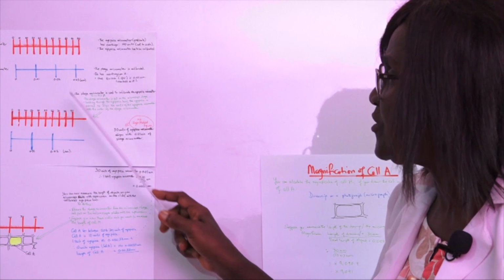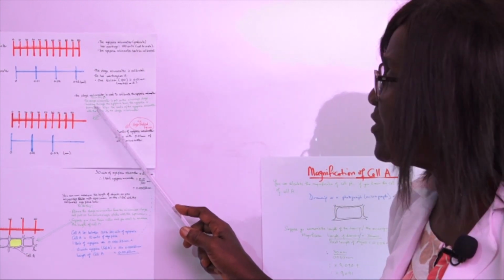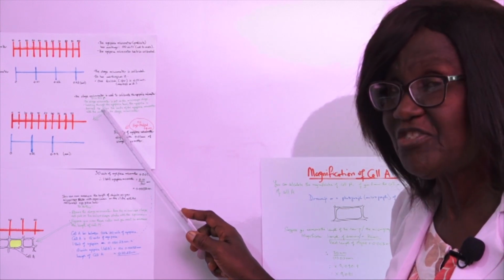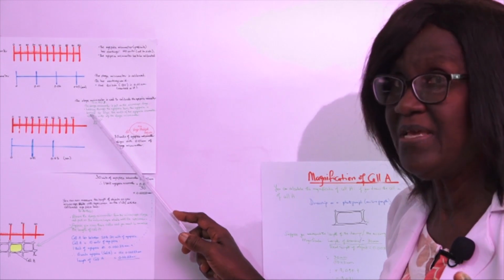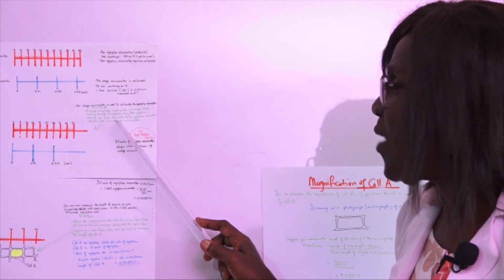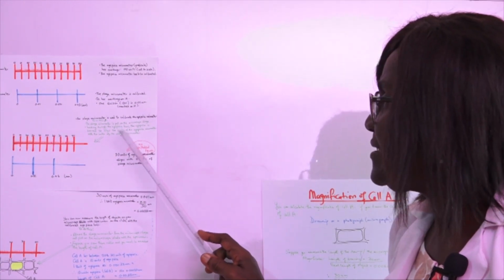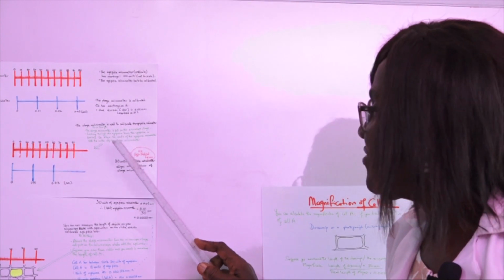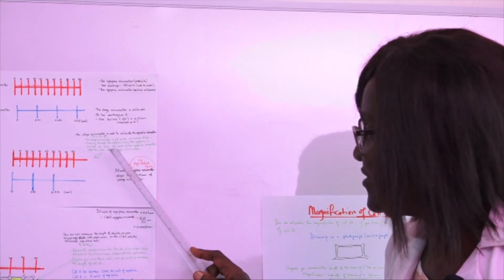It is put on the microscope stage, and looking through the eyepiece, you turn the eyepiece to align the eyepiece divisions with the stage micrometer divisions.